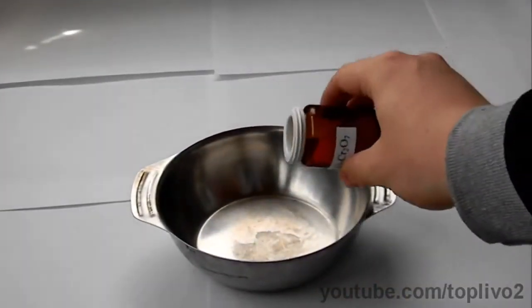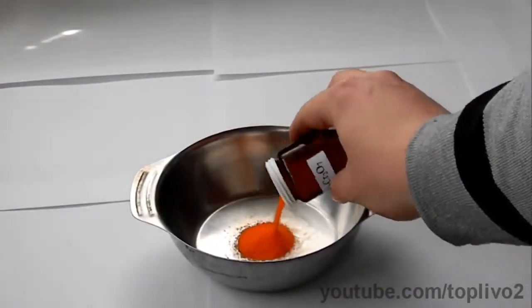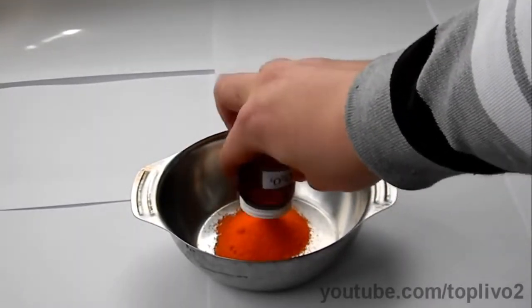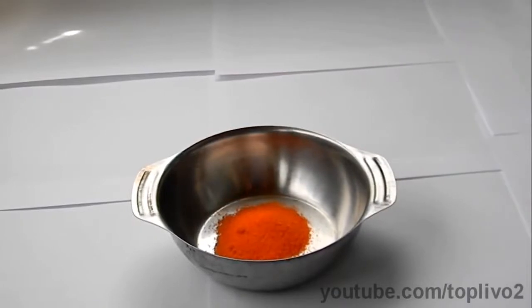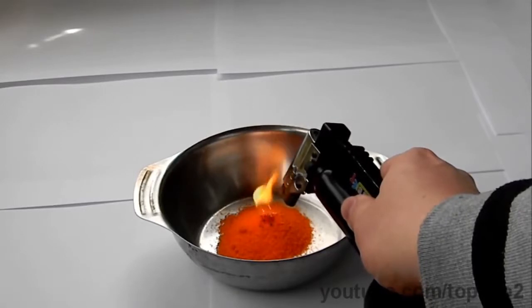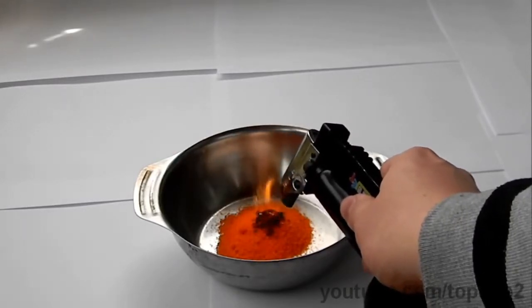For the reaction, we will take a metal cup and empty the entire amount of ammonium dichromate into it. Next, we ignite the substance using a burner and then observe a beautiful decay of the substance.